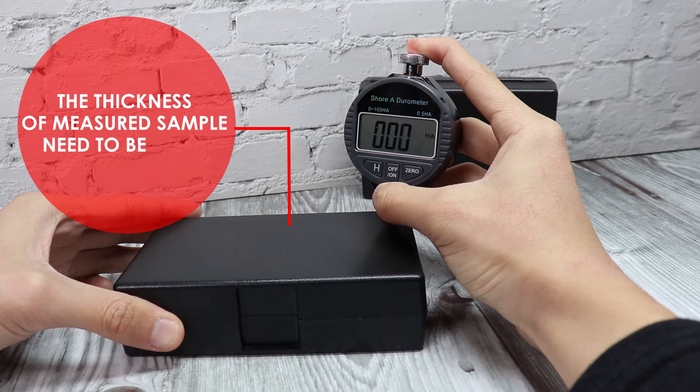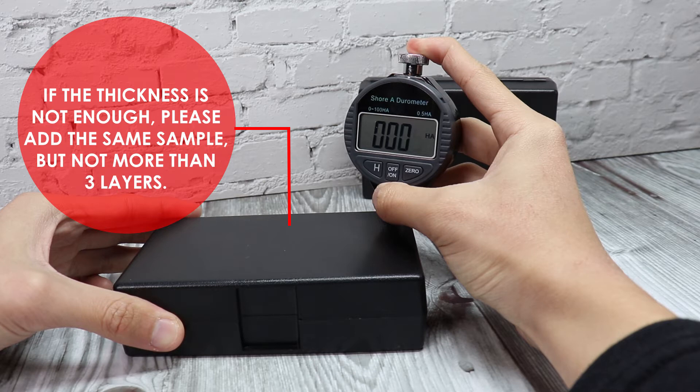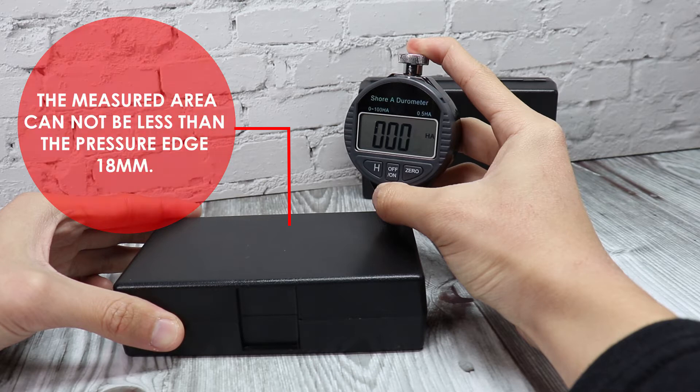The thickness of the measured sample needs to be more than 6 mm. If the thickness is not enough, please add the same sample, but not more than 3 layers. The measured area cannot be less than the pressure edge of 18 mm.